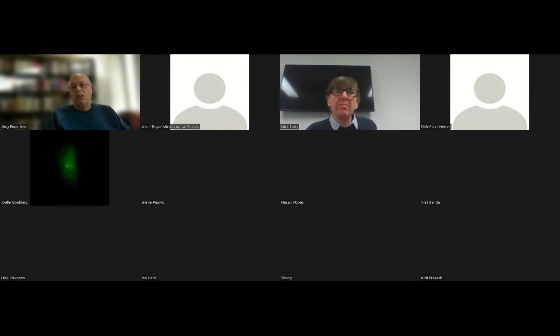Okay. So you're still looking after your cells. You're not worried too much about killing them off while imaging. No. I mean, and also we do this fast scanning. This is also some advantage. You are not driving them so much from triplet state into a bleach state. Because you scan so fast, they always have the chance to come back to the ground state until the next scan is coming.